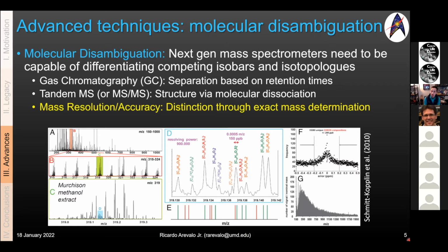It's a laboratory instrument, but it's an ultra-high resolution mass analyzer. And what you can see are peaks within peaks within peaks. This team saw over 40,000 molecular identities in the single extract of a single meteorite using this mass analyzer. That's a lot of complexity that otherwise might be masked with a more limited mass analyzer. I hate saying the word limited.